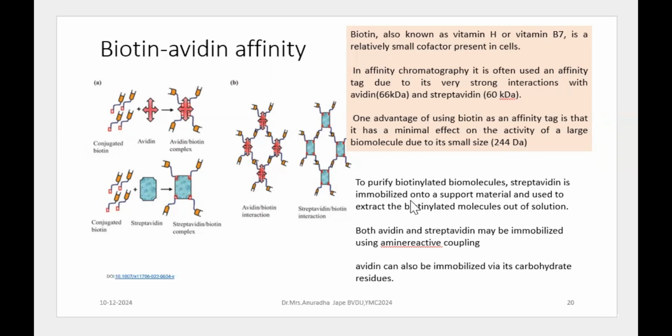So maybe you are adding a gene sequence that will allow synthesis of the biotinylated molecule, or maybe at the post transcriptional level you are going to have addition of certain functional groups, certain sugars, certain carbohydrates, or you can say certain glycoproteins, for example.